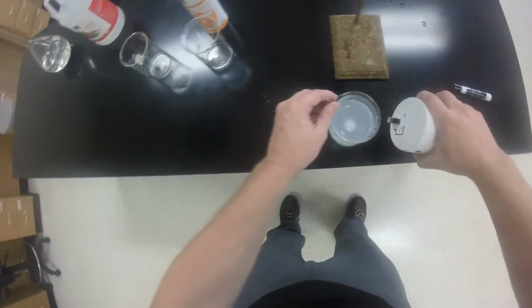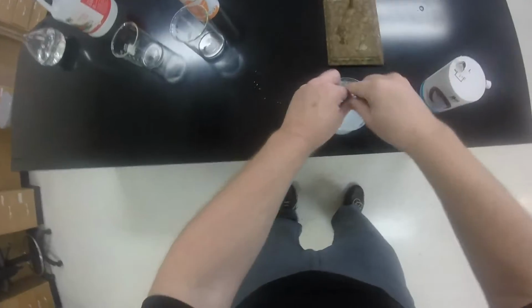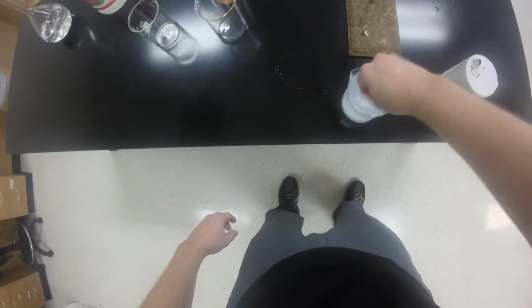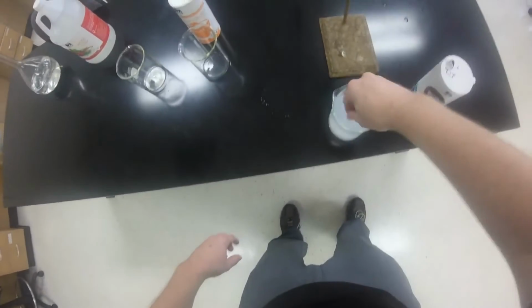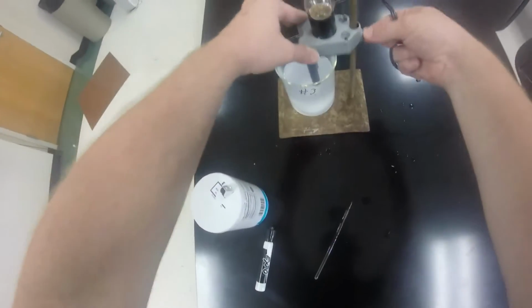Add just a little more maybe. So all that sodium chloride is breaking into all the different ions, the sodium and the chloride, and so now there should be charge carriers in the solution. So now let's lower it down into our solution.